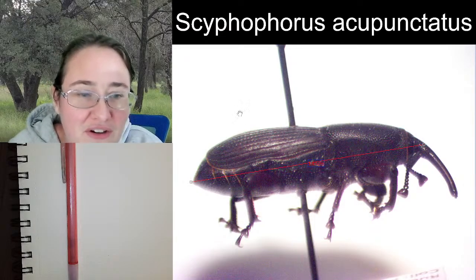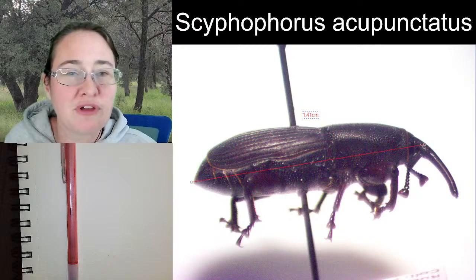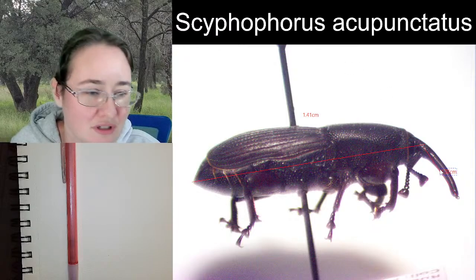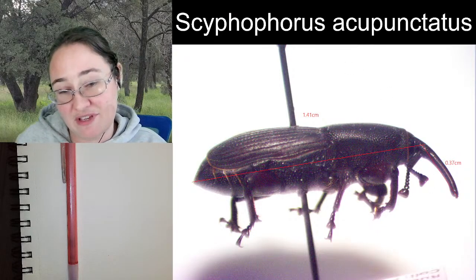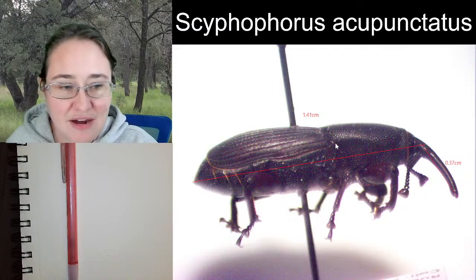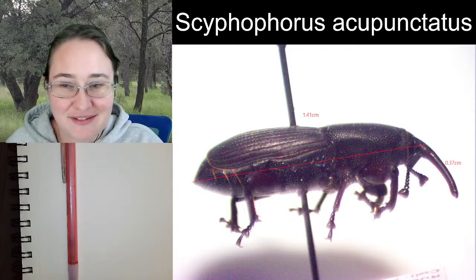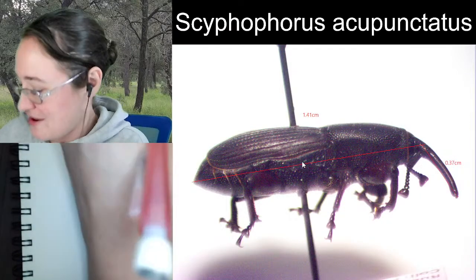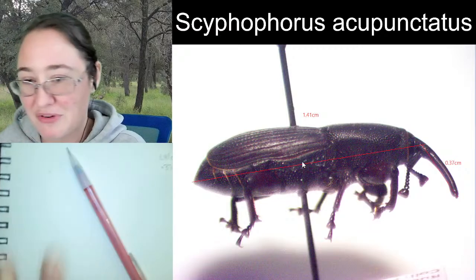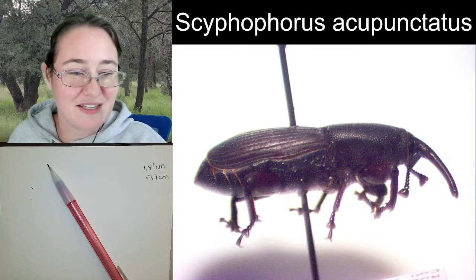In centimeters? Oh, it's there. I just have to grab it. Alright, so it is 1.41 centimeters long, and then its snout is 0.37 centimeters. So in total, if you were going to lengthen that snout out, it would be 1.78 centimeters. Alright, let me write those down before I erase them. I think that's what happens regularly, is I end up reading them out loud and then erasing them and realizing I haven't done that yet. It's okay, you can delete the measurements.